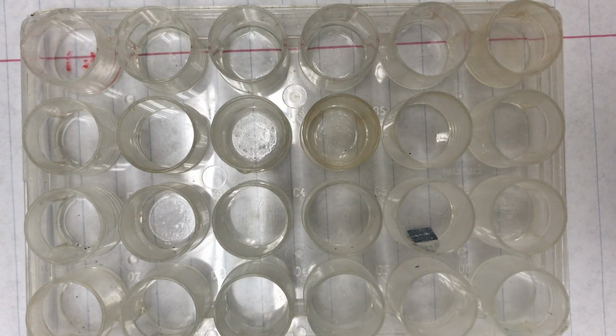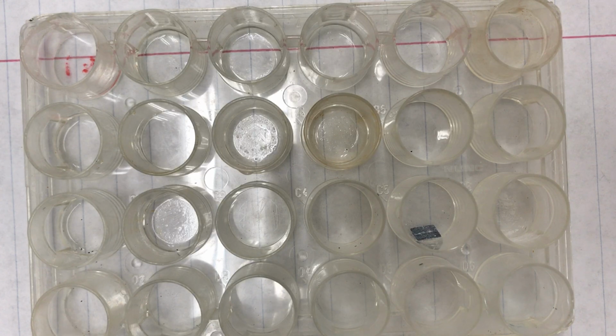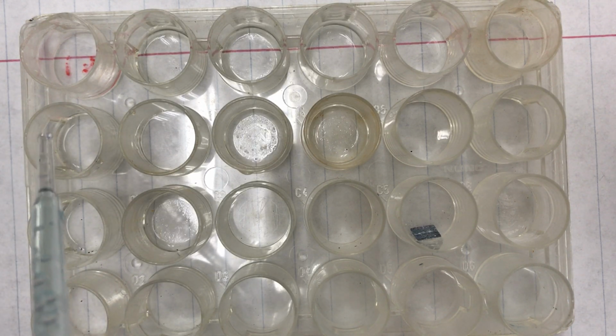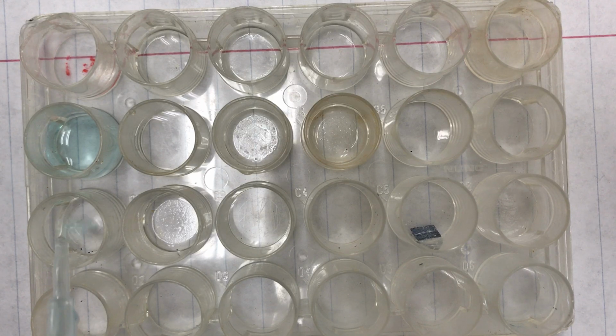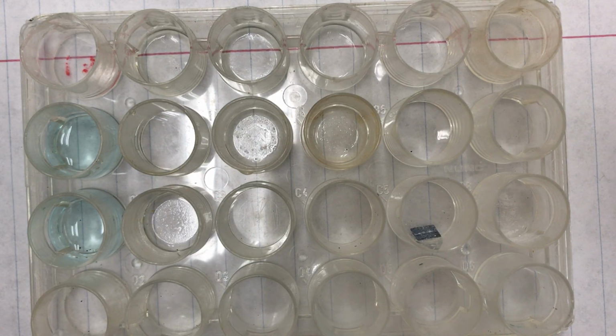Alright, so starting with copper 2 sulfate in well B1, in well B1, C1, and D1.